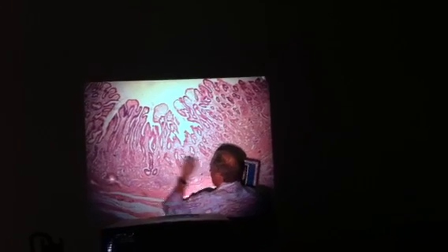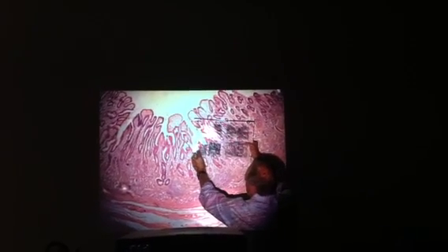All right, lamina propria. Now, if you look at Rust, he'll use the term, and if you can see in the light here, right there it says lamina propria. That's the area between these pits and so forth.